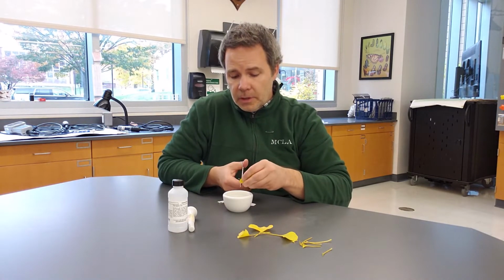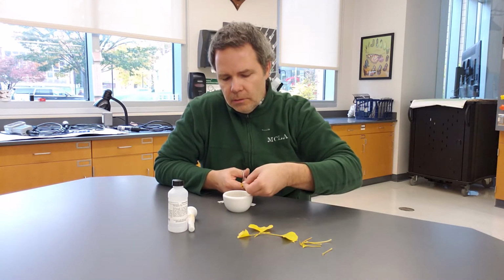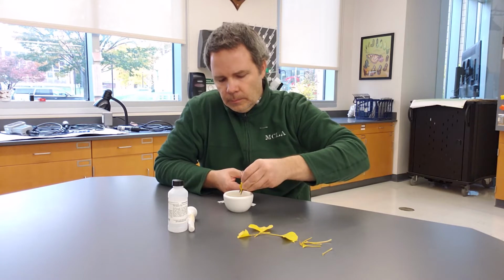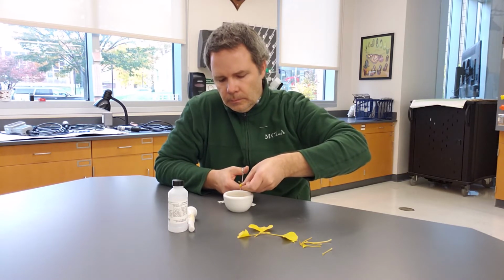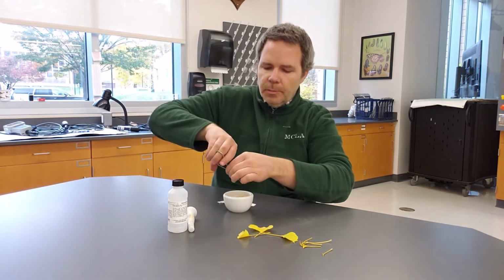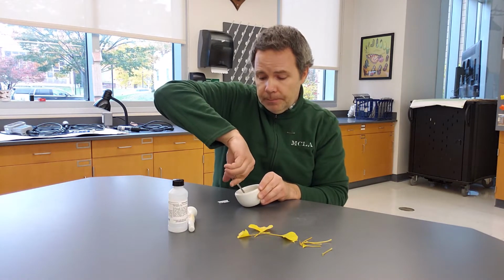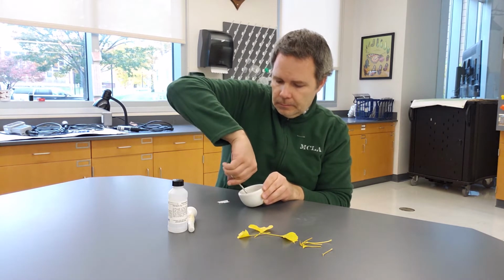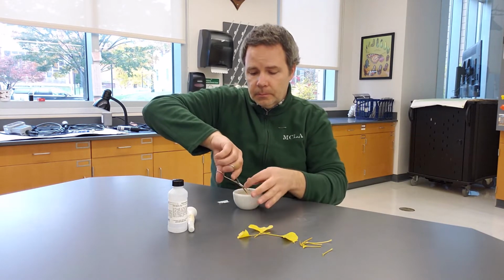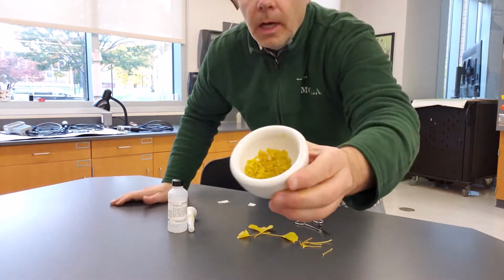So once I have those leaf blades, I'm going to start cutting them up. I'm going to cut them into small little pieces with these really sharp scissors here. Okay, so I've cut them into little pieces, and I'm going to just keep chopping them. Might be able to chop them a little finer, but these little scissors are actually hurting my thumb. And that's what we've got here.